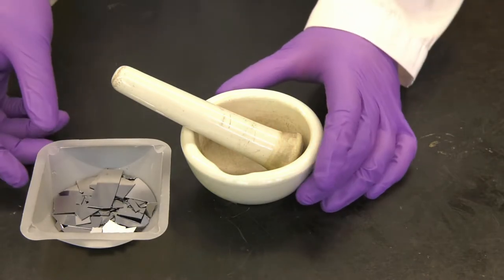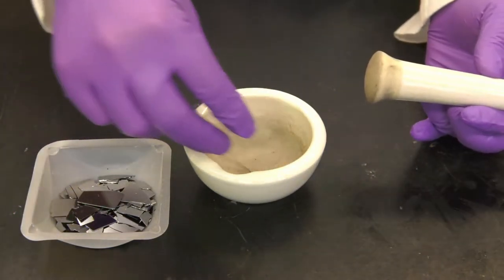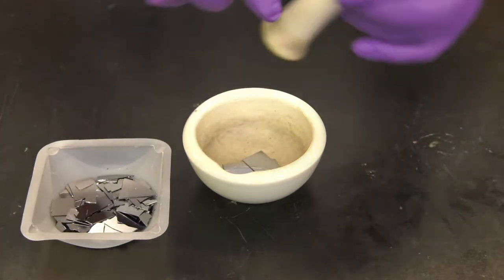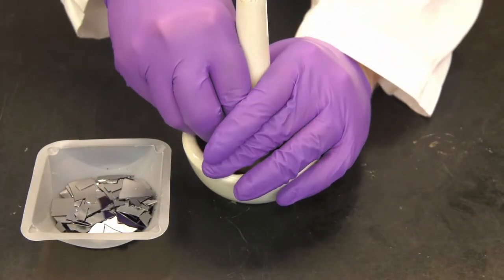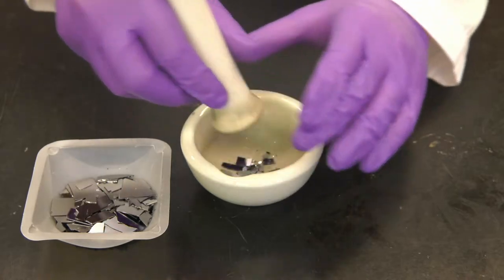The large pieces of silicon are crushed using a mortar and pestle. A mask should be worn while crushing silicon to prevent inhalation of silicon dust.